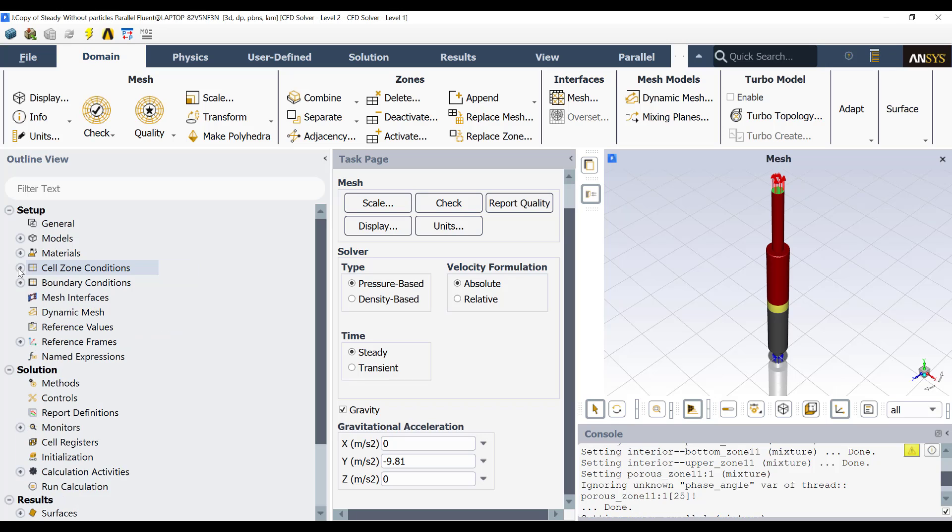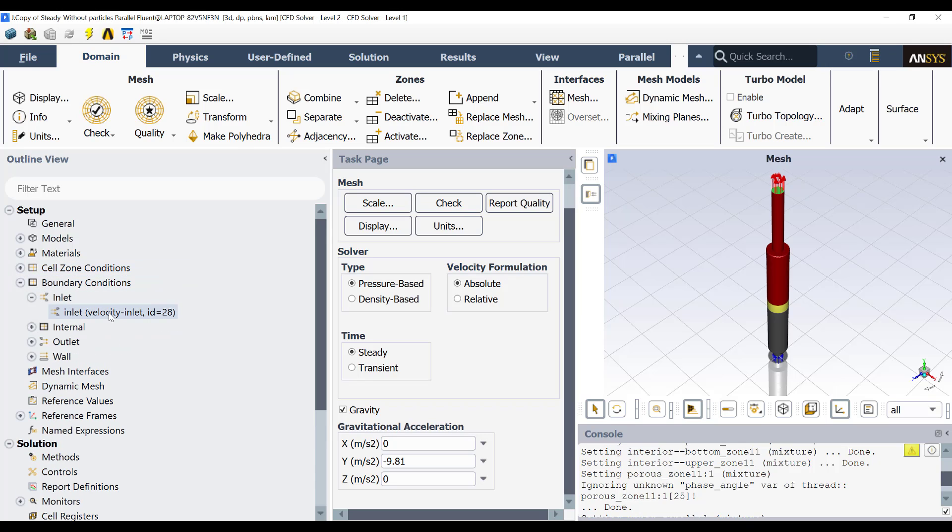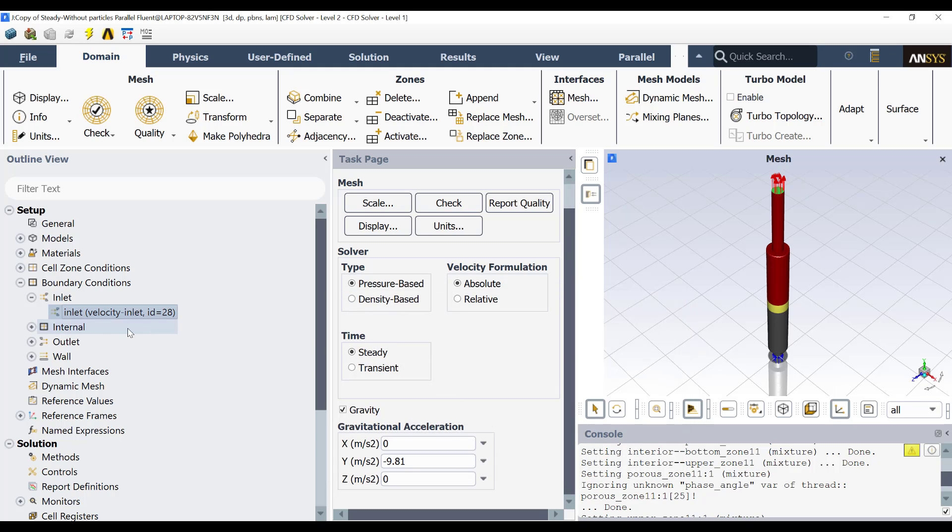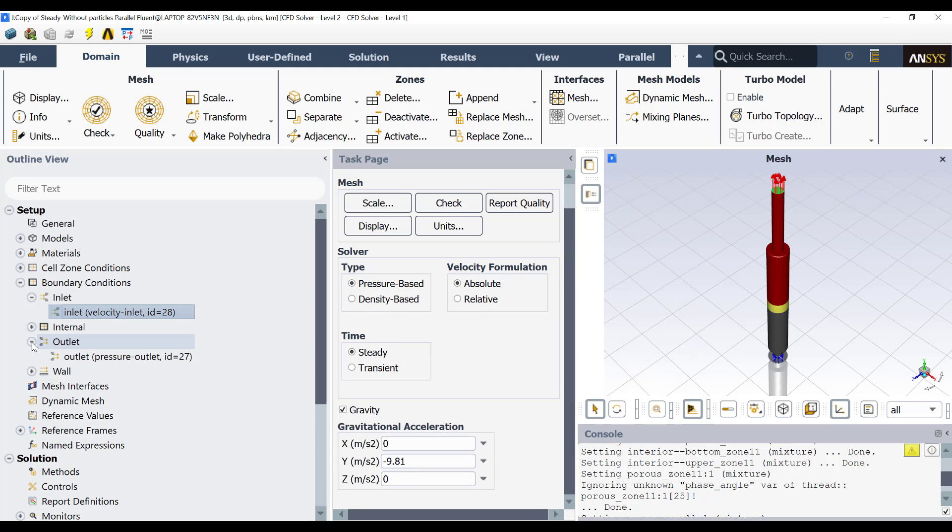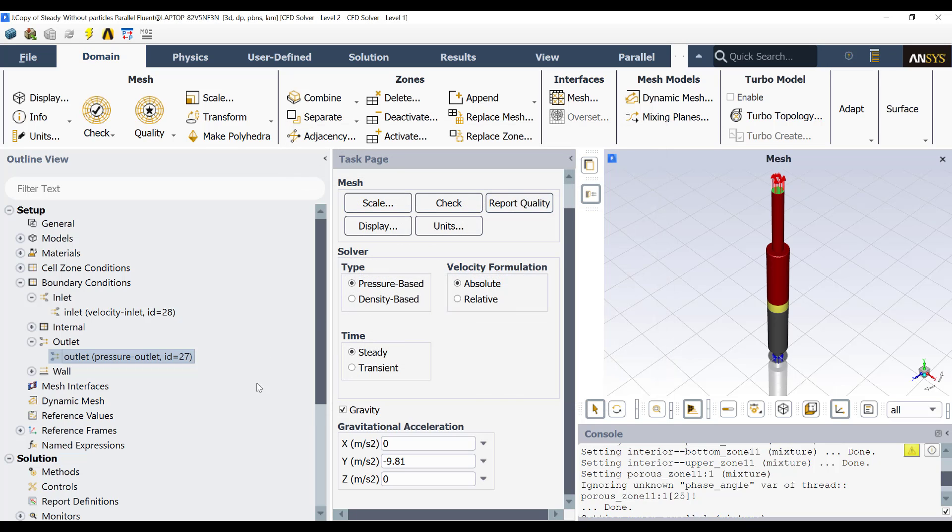Also, then in the boundary conditions, I have a velocity inlet. In this case, it is a very, very, very low velocity. You see here, then that was the reason I used a laminar approach. And the outlet, you see the outlet is a pressure outlet with gauge pressure of zero, then atmospheric pressure.